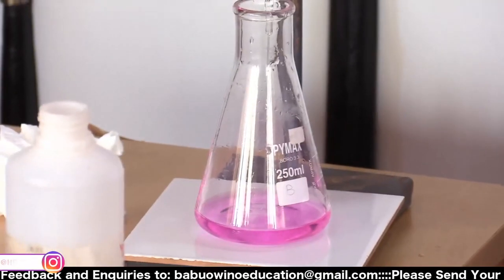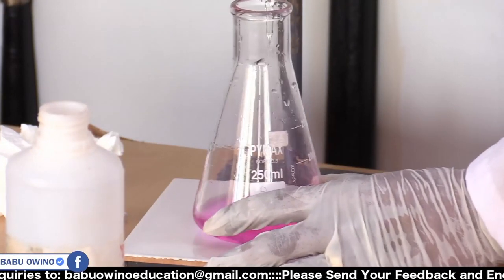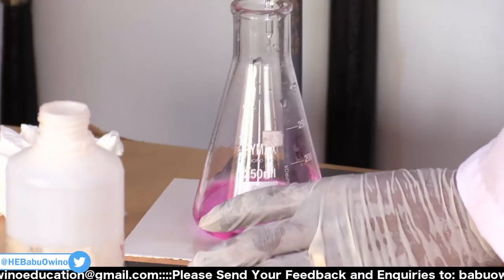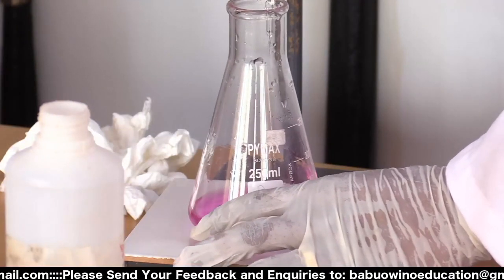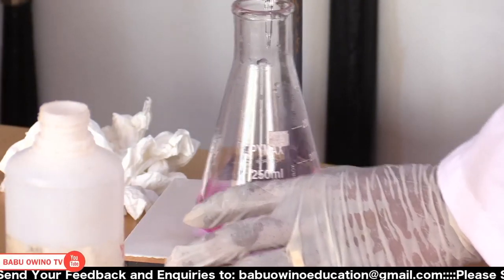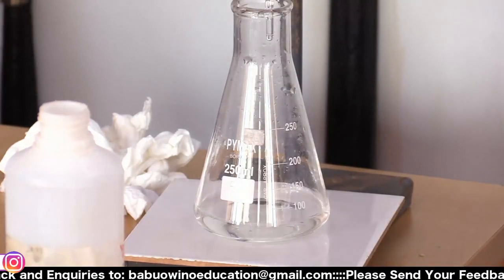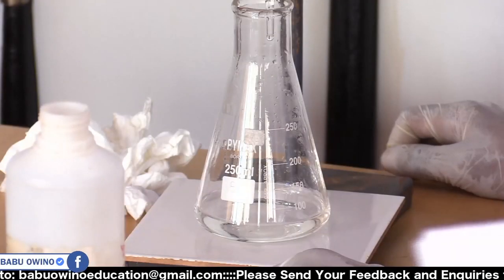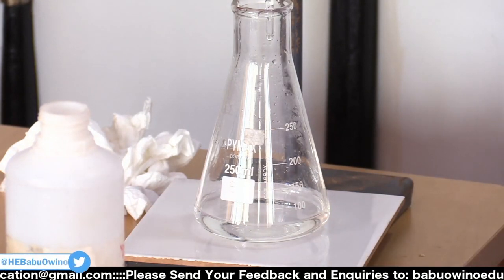This is the first titer we are doing. So we'll take another one so that we are consistent. Mostly the first titer normally is to know how you are going to move next, so that you are consistent. Final reading, 25.